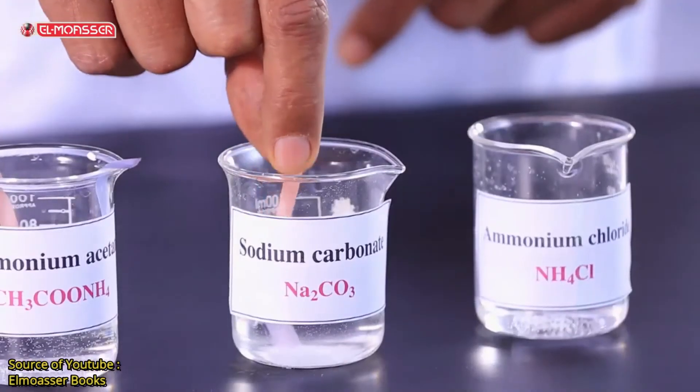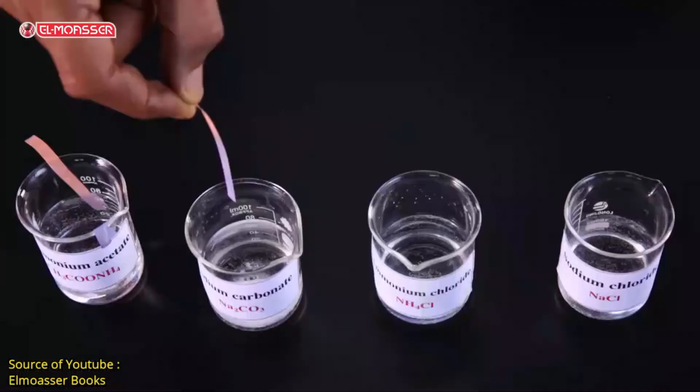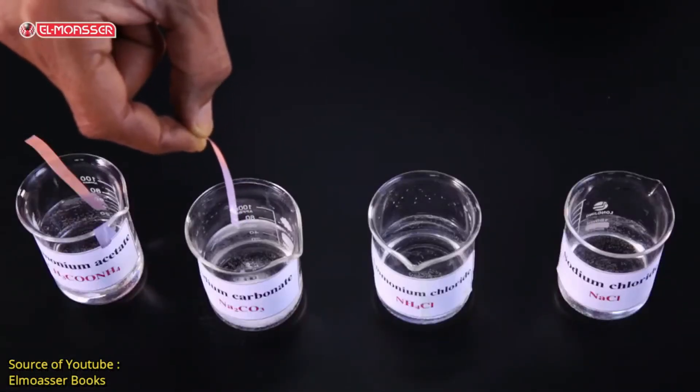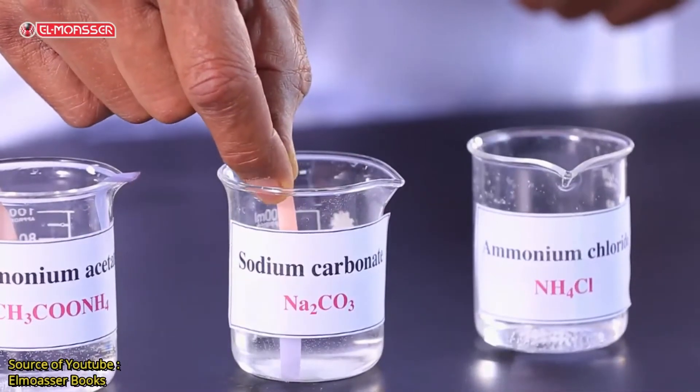What do you observe? The red color of litmus paper turns blue, indicating that the solution of sodium carbonate is alkaline.